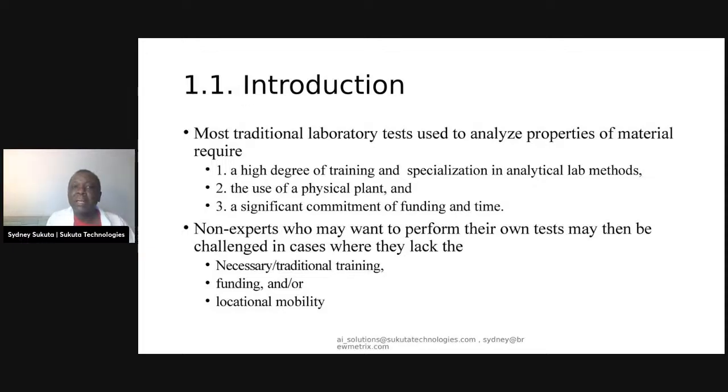So most traditional laboratory tests used to analyze properties of materials require a high degree of training and specialization in analytical lab methods, the use of a physical plant or laboratory, and a significant amount of funding or commitment to funding. And of course, all of these can be barriers if you want to do your own tests or if you're a non-expert. If you're a non-expert and you want to do your own testing, you'll be challenged because you lack the traditional training. You may be able to find funding, but you just won't have a lab. So we need to find a way around it to make this universal.